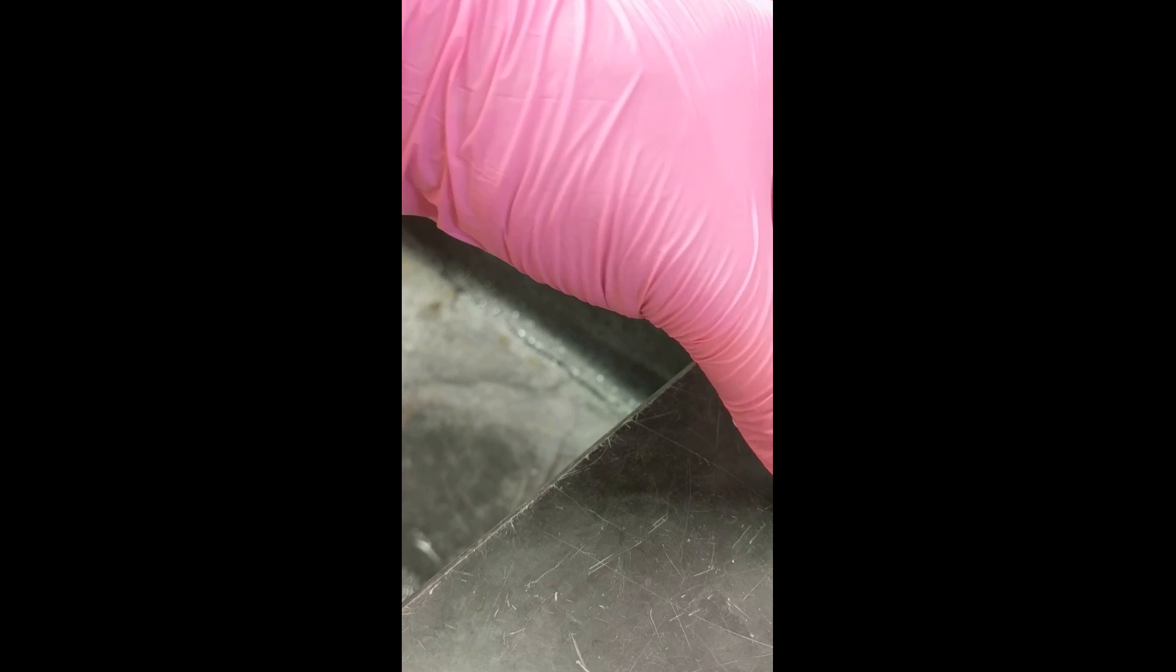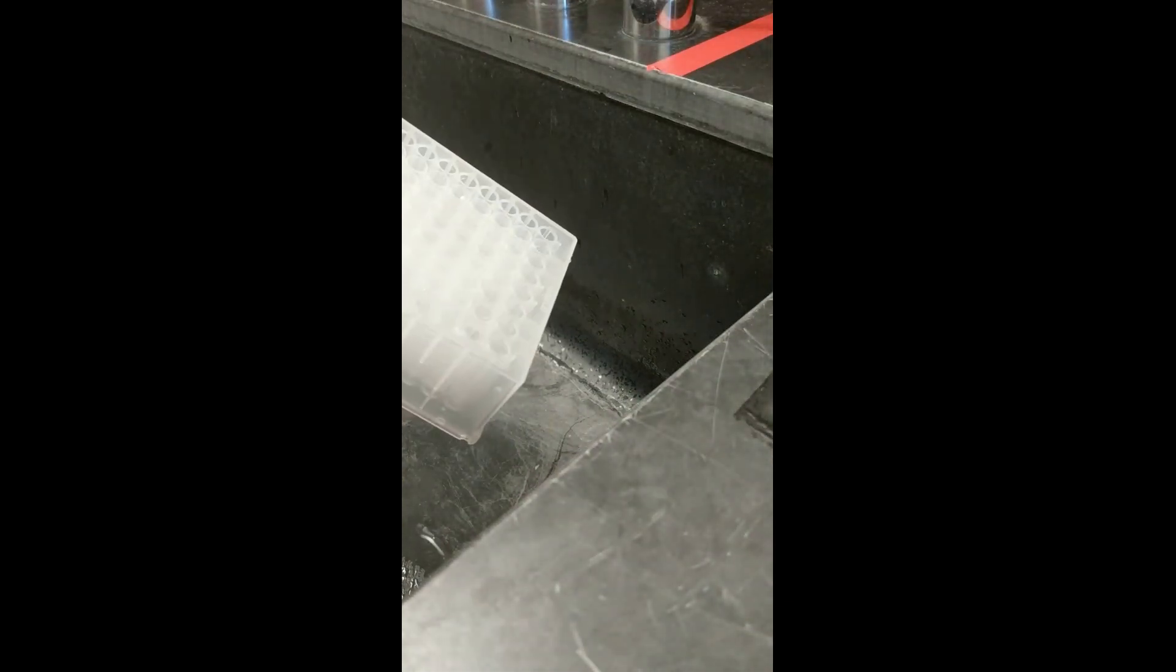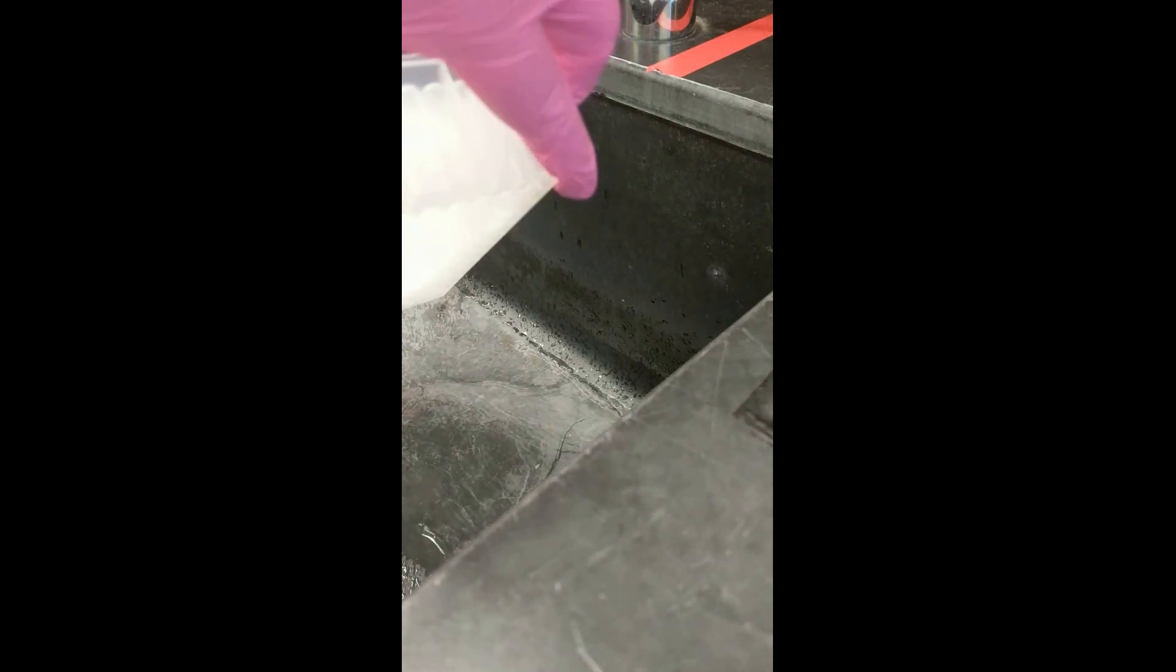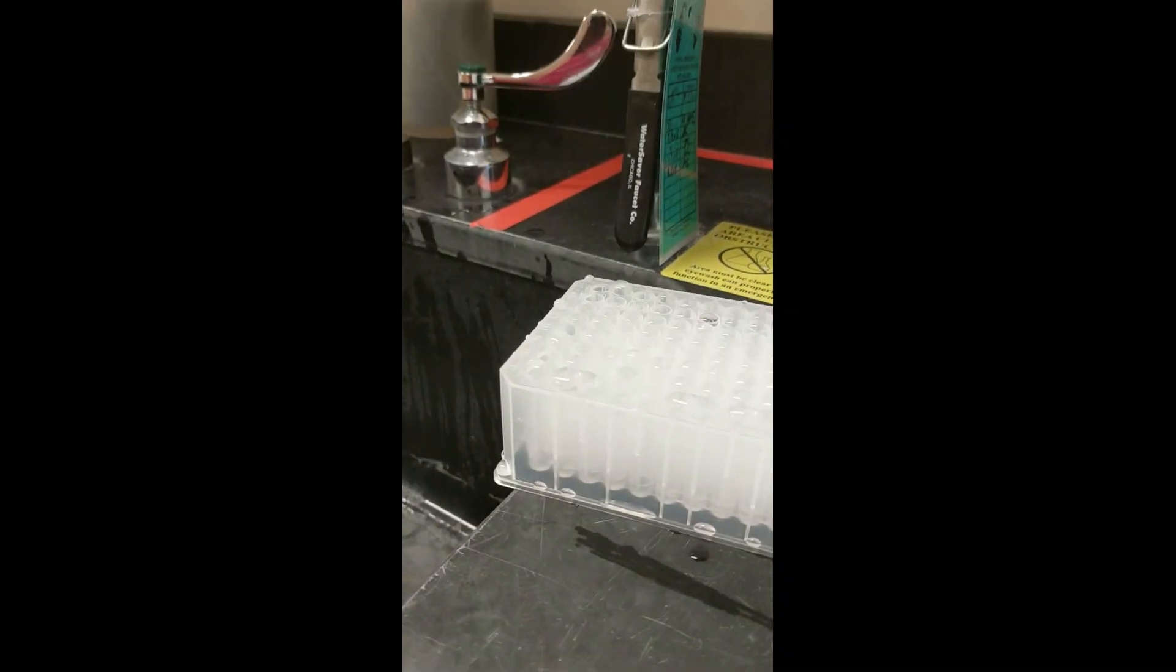After the DNA pellet has settled, you should decant out the solution very carefully and then add 700 microliters of 70% ethanol. The plate should then be centrifuged at 3600 RPM for 15 minutes.